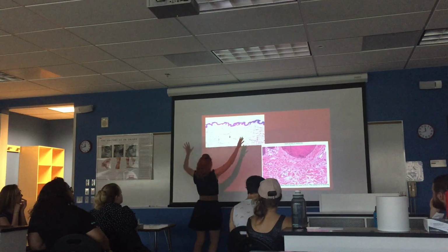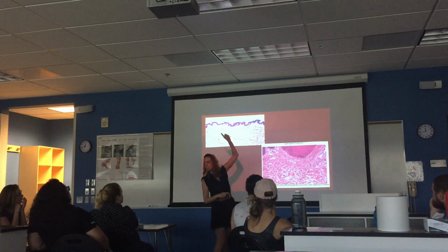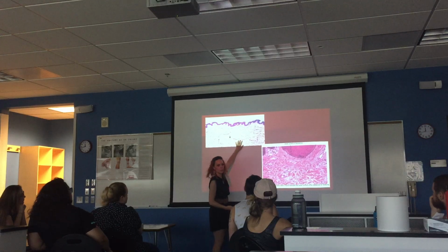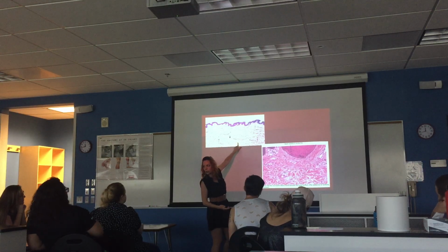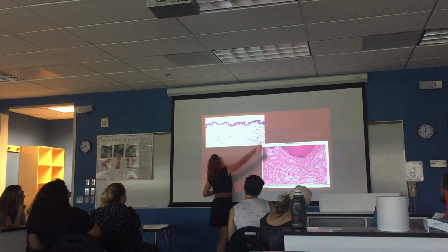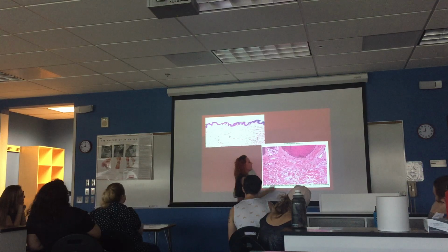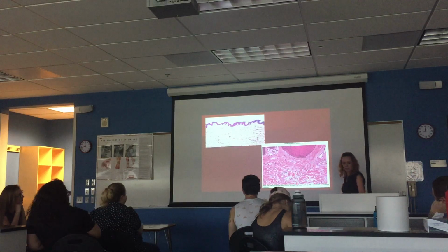All right, so this is skin. There's my stratified squamous epithelial. My epithelial tissue is at the surface. Generally, yes, you can find some epithelials down in here, but if you call me over here looking for stratified squamous, I'm going to tell you to go back to the space station and find the edge, the coast. If you're looking for the coast and you're all the way landlocked, you're not going to find the coast. So go out here, there's the stratified squamous. Down here is the dense irregular. So this is skin, epidermis and dermis, chapter 5.